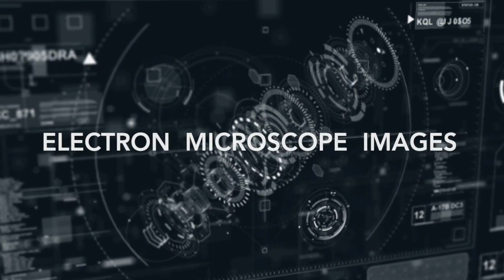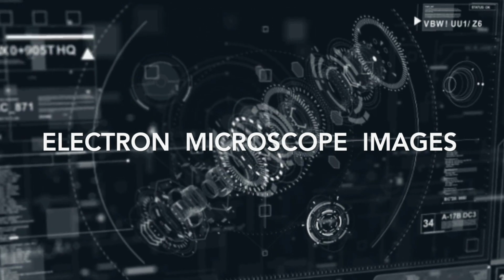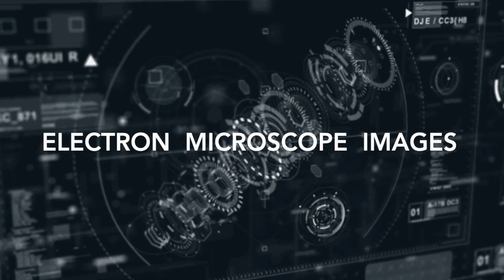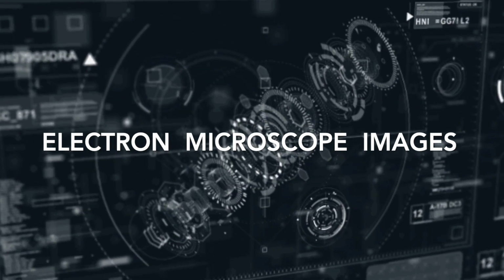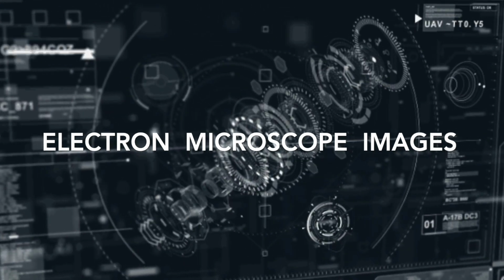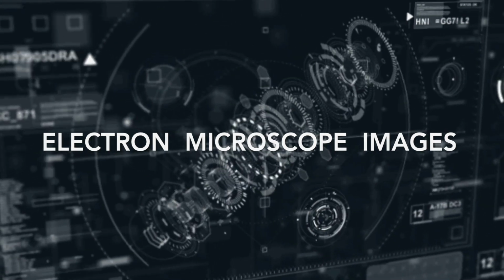Scanning electron microscopes allow us to see microscopic things in a new light and reveal so much more than what we can see with our naked eyes. While some images taken by an electron microscope can be easy to recognize, others are quite surprising as small things can look very different up close. Have a look and see if you can recognize the following electron microscope images.